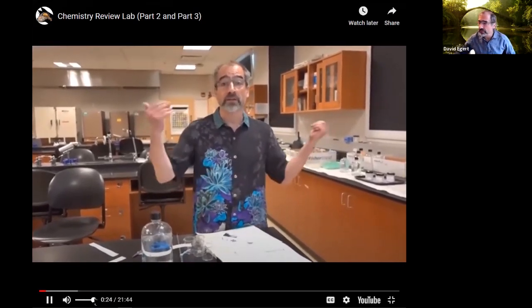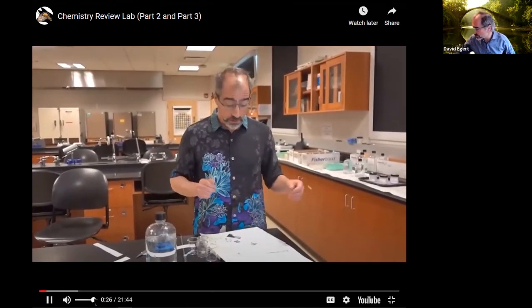I forgot. So now we're going to do parts 2 and 3 of the chemistry review lab, and parts 2 and 3 are very similar to each other. It's just part 2 is dealing with electrolytes, and part 3 is going to do the same basic steps, but with carbohydrate, in this case, glucose.